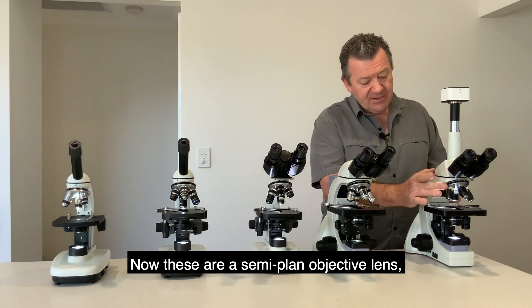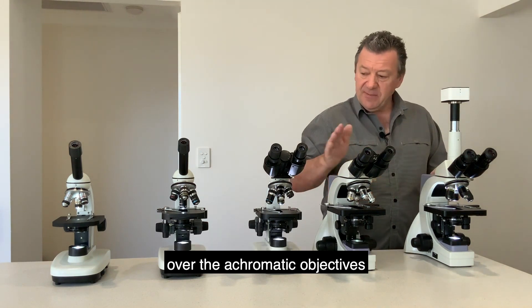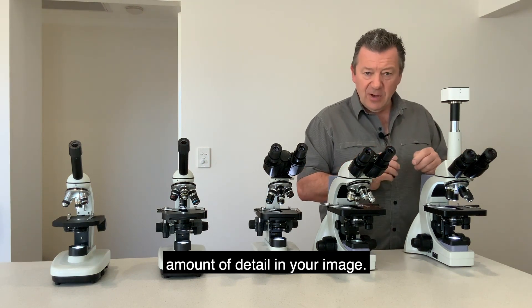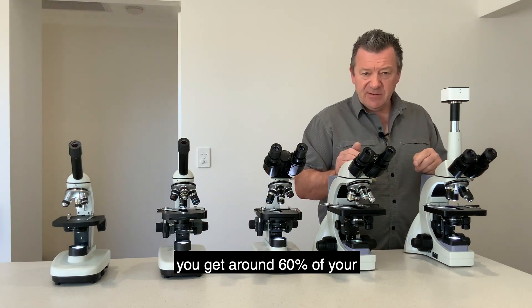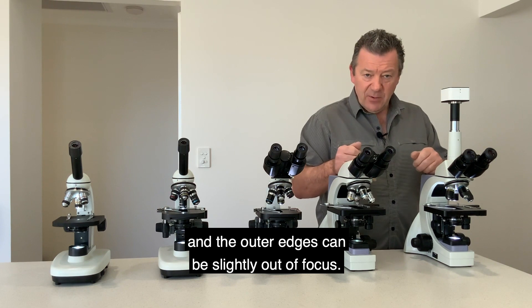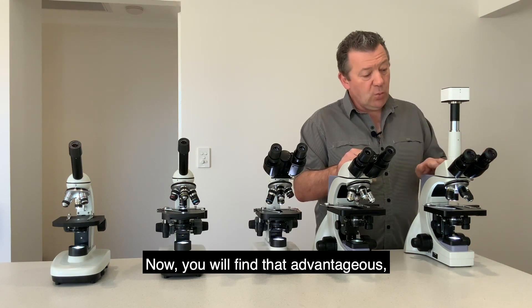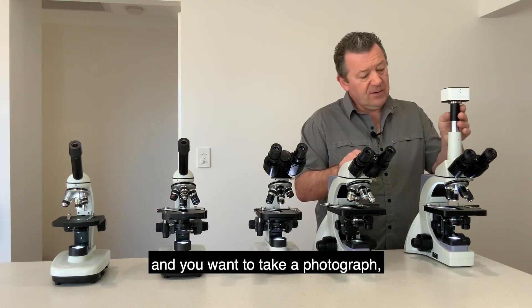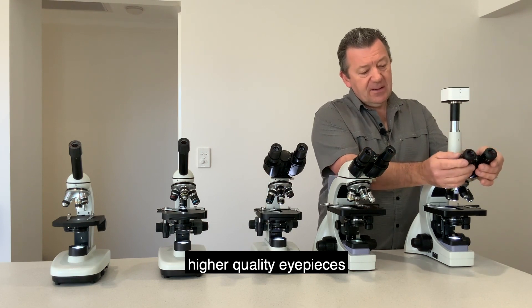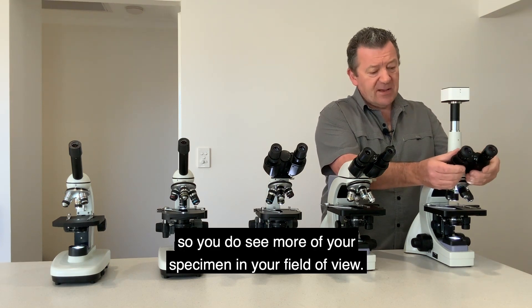The advantage of semi-plan objectives over achromatic objectives is the amount of detail in your image. With an achromatic objective you get around 60% of your specimen in full focus and the outer edges can be slightly out of focus, whereas with the semi-plan you get 80% of your specimen in complete focus. This is especially advantageous when using a digital camera to take photographs. We also have higher quality 10x wide-field eyepieces so you see more of your specimen in the field of view.